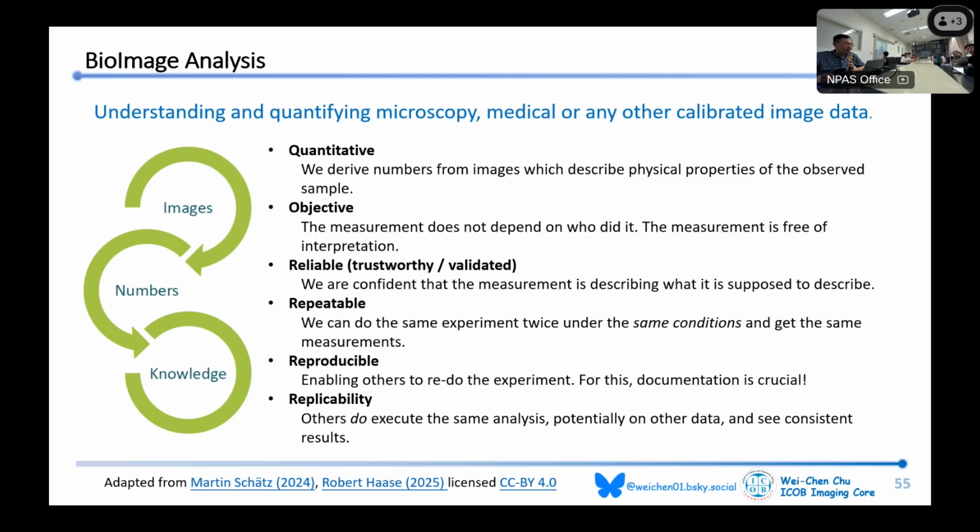Reproducible means if you provide the image analysis workflow to other people, they can reproduce your image analysis result. For this, documentation is very important. And replicability means other people can do the same analysis, potentially on other data, and get the same trends.